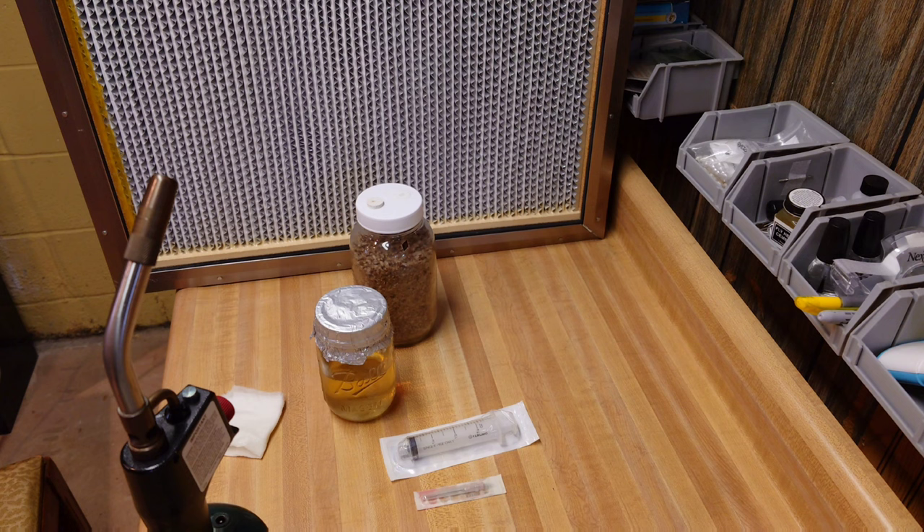We're going to shoot that jar full of 20cc's, hopefully get a little back out. Whatever we get back out goes right into the LC jar and we should be ready to rock.